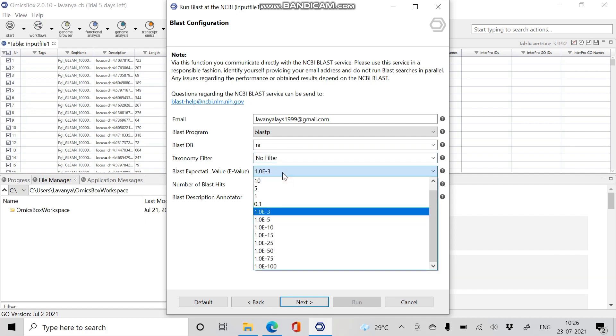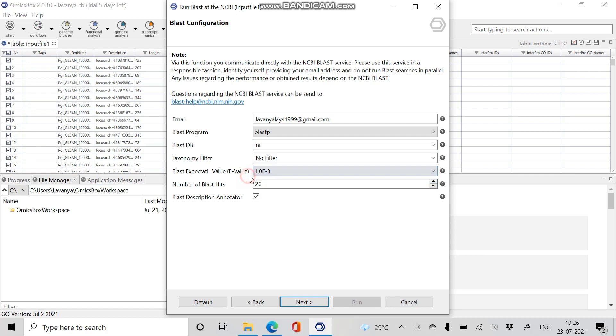BLAST E-value is a statistical significance threshold for reporting matches against a database sequence. If we increase the E-value, it shows less stringent matches, so it's better to set a lower value. We are giving the default value. The number of BLAST hits is the number of alignments we want to achieve, from 0 to 20. I am giving default as 20. After entering the required information, click Next.